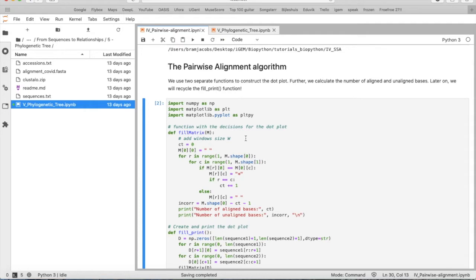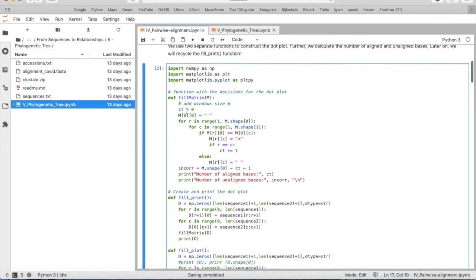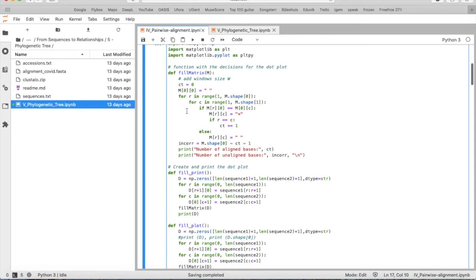But first of all, let's have a look at the algorithm that we will need to do the pairwise alignment. So first of all, we will make the function fill_matrix. In this function we will take every nucleotide per sequence and we will compare them to the nucleotide of sequence 1, to the nucleotide of sequence 2.